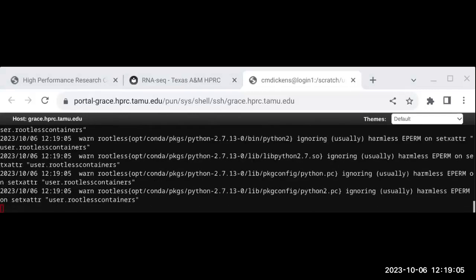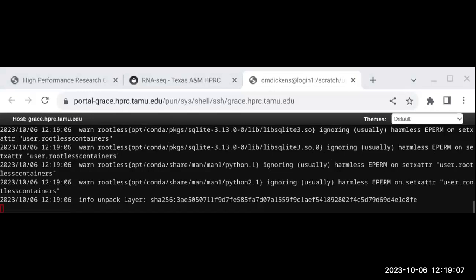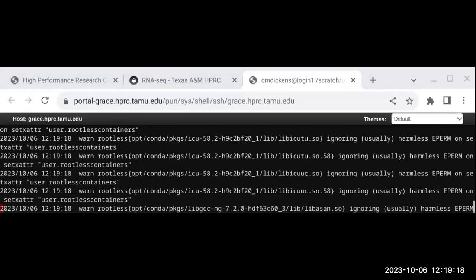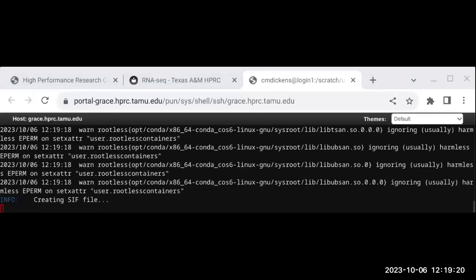That's a single tool. But if you have a really complex installation with several tools, that might be a larger image. But generally, you need to use the entire compute node. You can put this into a job script. That's what this page is, job script, and submit it as a job script. That way you don't have to go interactively and wait for it.